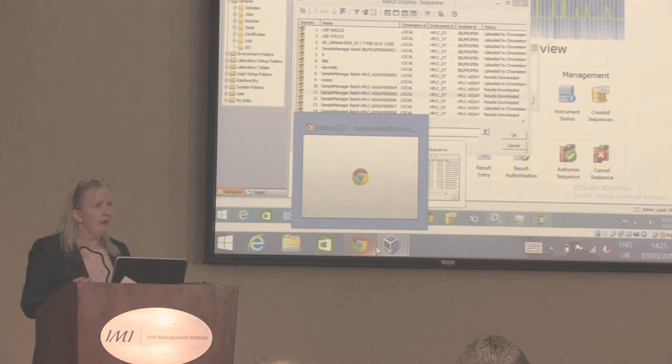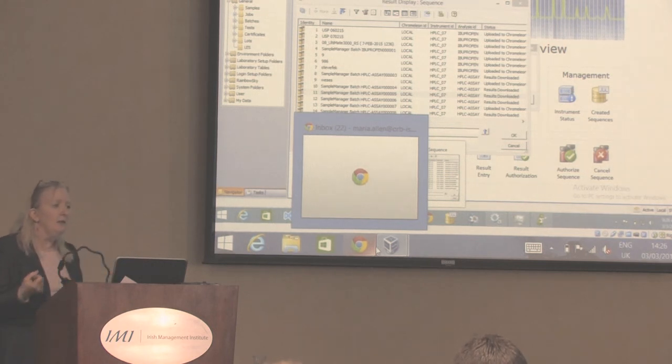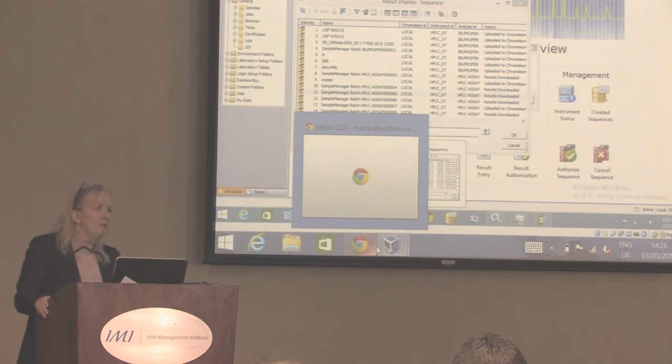By having your SOP on one side and your LES on the other side, you can build your logical steps. As you're going through building your method, you can add a step, modify a step, or change the order of steps. So if you set it up and then go, oh no, I wanted those steps in the reverse order, you can just swap the steps.